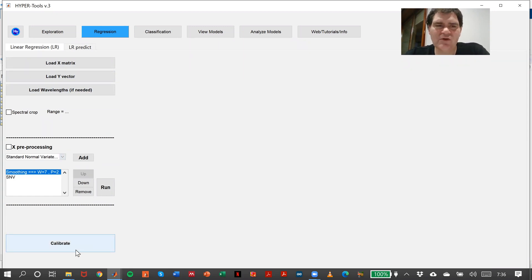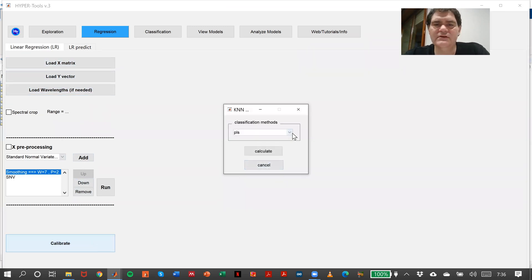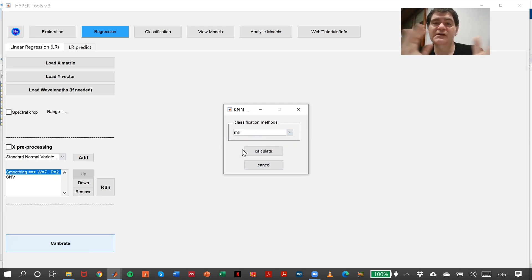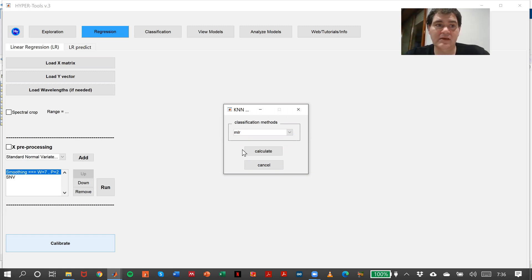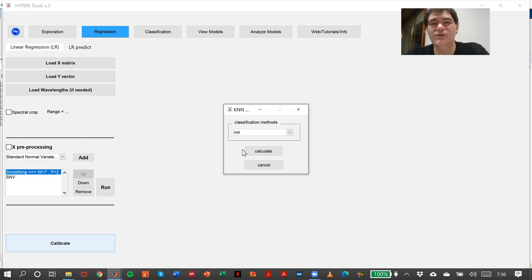Then in regression you load again the X matrix, the Y vector, the wavelengths, and perform first derivative. If you want to try instead of PLS, for instance MLR, you can do it. Easy. As you can see, it's very easy to go back and forward in the app, in the software. That's very nice and versatile for regression and for classification.